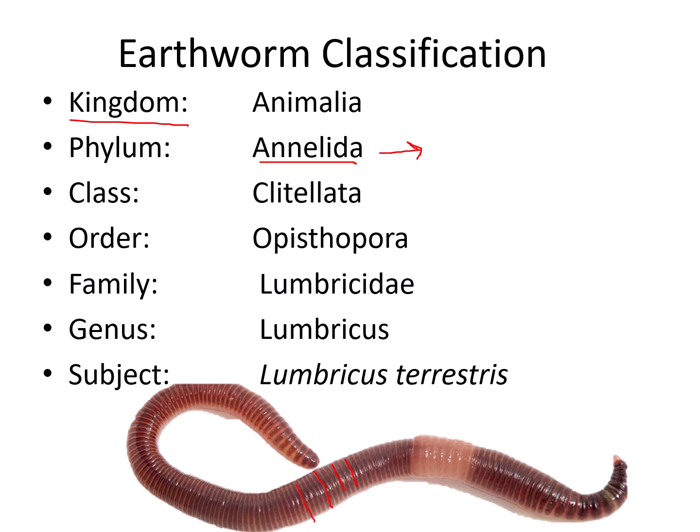There are septa running from exterior to interior, meaning these bodies are completely separated into segments from the outer side and the inner side. So due to these annuli, these animals are classified in phylum Annelida. They are ring-like structures. Animals that have ring-like structures would be classified in phylum Annelida.